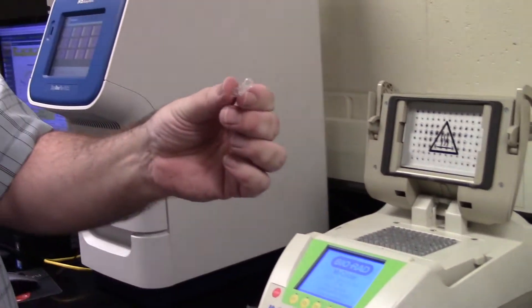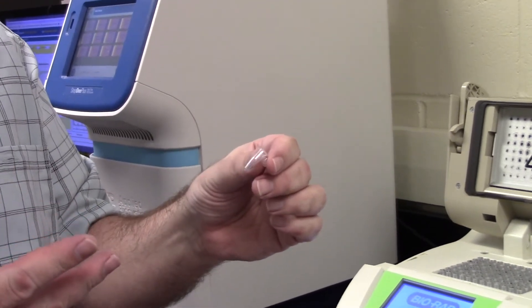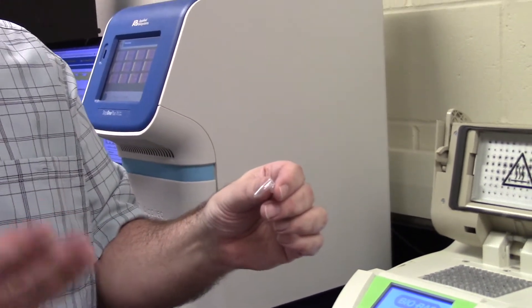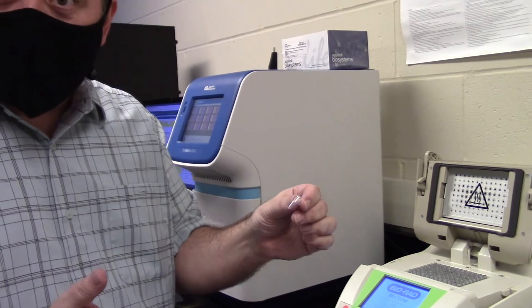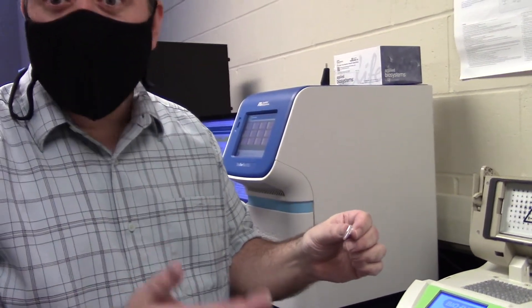We'll fill up this tube with water, polymerase, dNTPs, and buffer. dNTPs are the A's, T's, C's, and G's that we make DNA out of. And then our primers and our template.